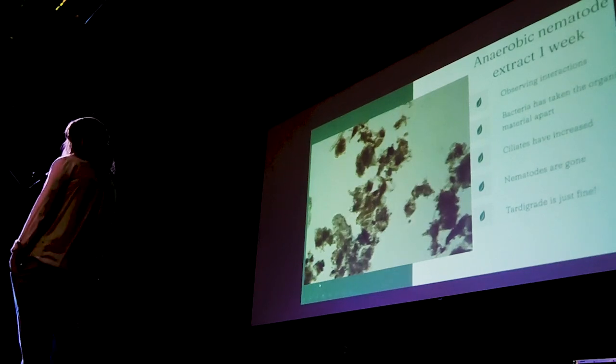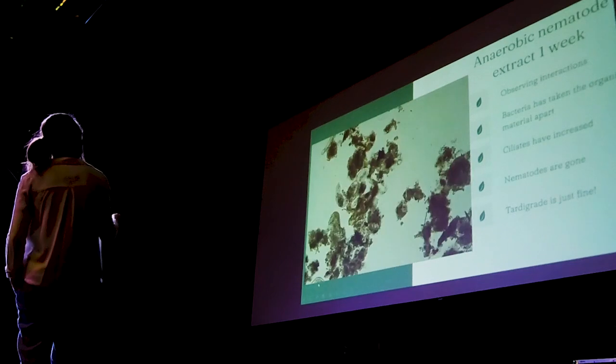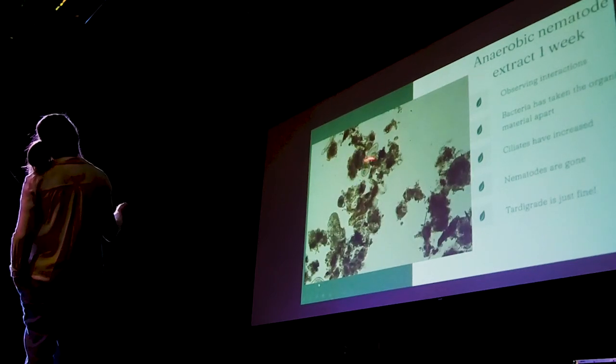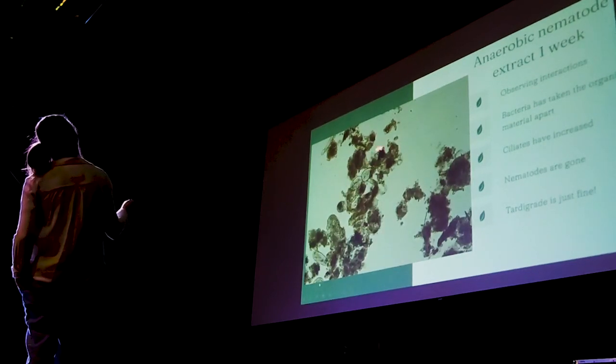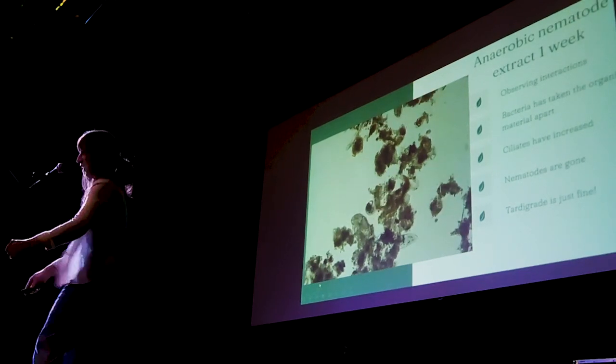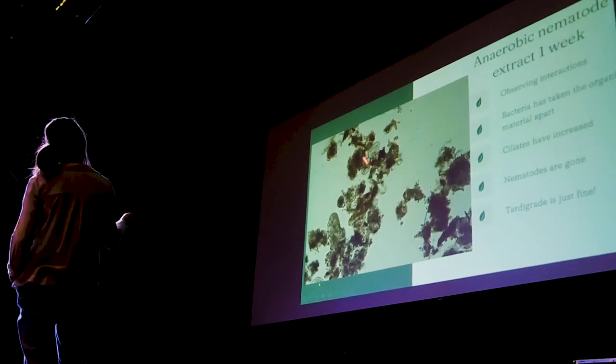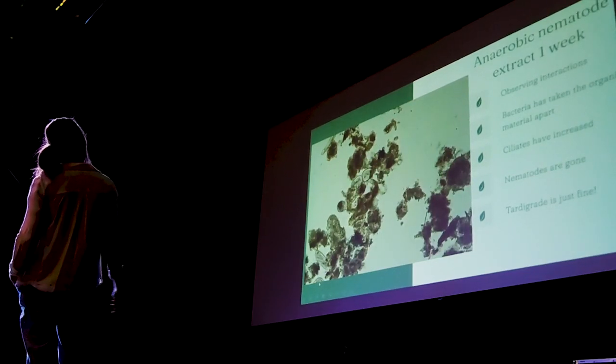There's also not a lot of diversity of ciliates, but there's one there that is really happily reproducing. And I like this video because it almost seems like it wants to get away from itself. It keeps running head first into the aggregates, and I think they're just trying to split away from each other. But that's what they look like when they reproduce.